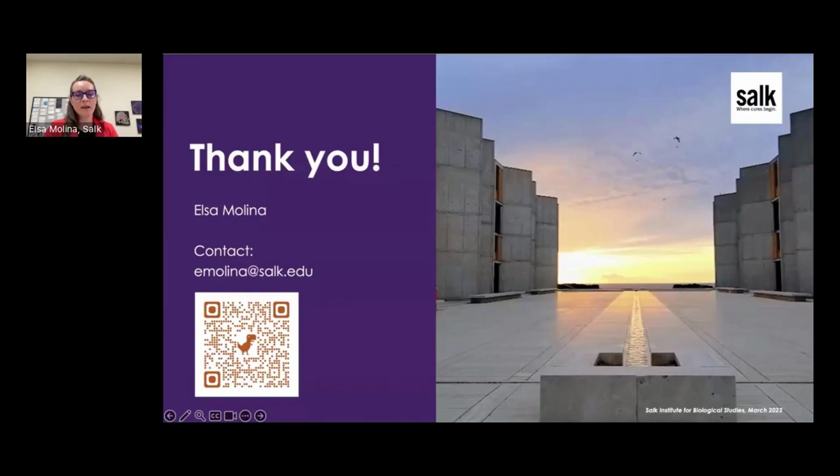We have to keep in mind that spatial transcriptomics is a new technology. It has only been around a couple of years. So I really think all the instruments need improvement, especially regarding the software. For me, there is not a very good, reliable instrument on the market right now regarding software.